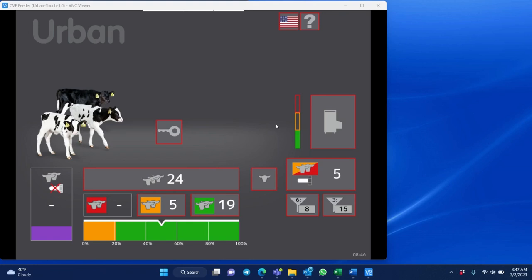Hello and welcome to the Galaxy Tip of the Month. Today we're going to talk about AlmaPro Maintenance and Calibration. Maintenance and calibration should be completed regularly, at least on an annual basis.